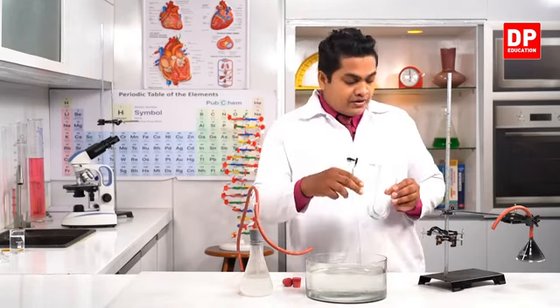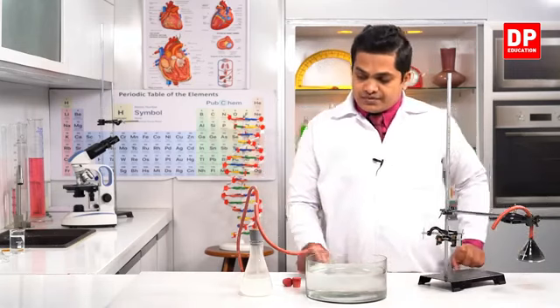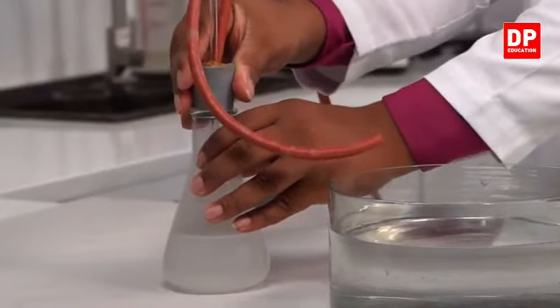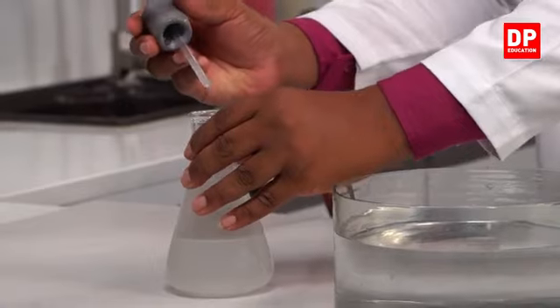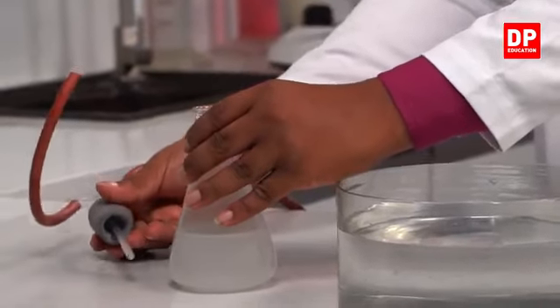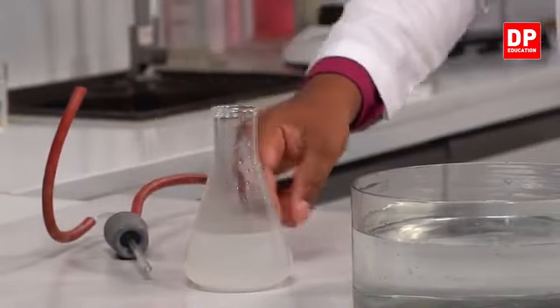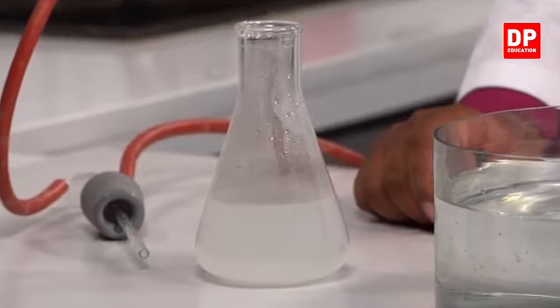Okay. So now let's come on to the other vessel where we use the colorless lime water, right? So here you can observe that the colorless lime water has also got a milky white color.